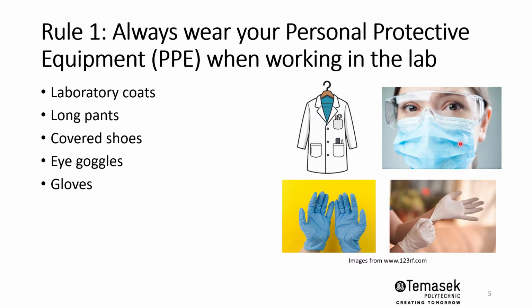Eye goggles are important when you're doing any open bench experiments, as well as the wearing of gloves. You will notice that there are two types of gloves, and even more types of gloves in the lab. These are your nitrile gloves on the left here, those are in blue. They have good chemical resistance, and it's an overall good choice, especially for people who have allergy towards latex.